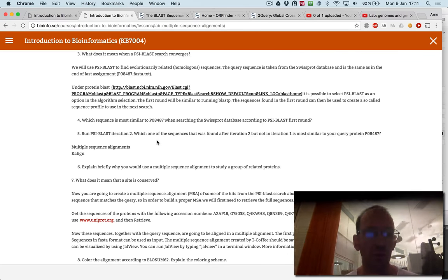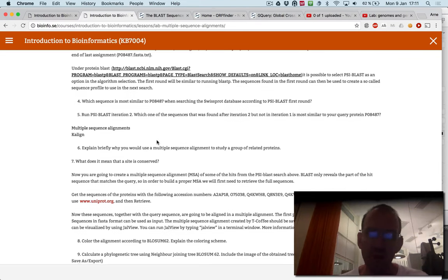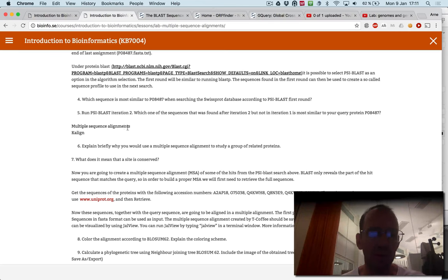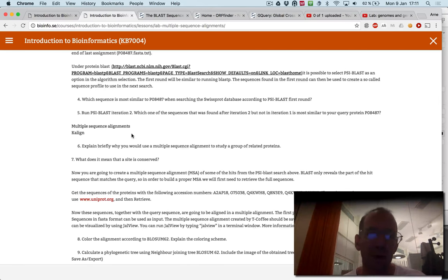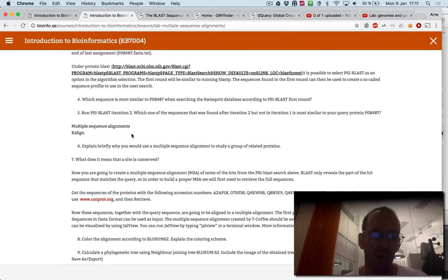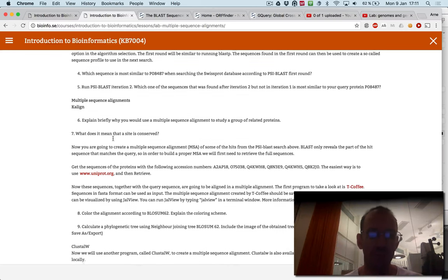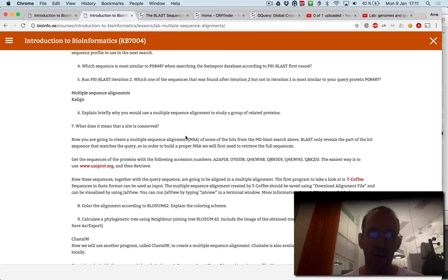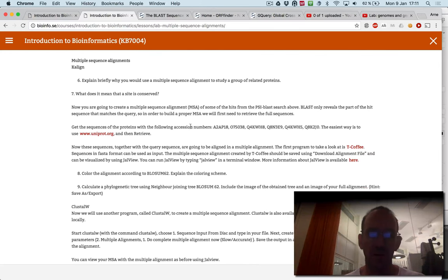You have the sequence, and you should run almost the same as you did before. Then you should actually use a multiple sequence alignment, which is a program to align more than two sequences. We use the program K-align here, and you should download a number of sequences.